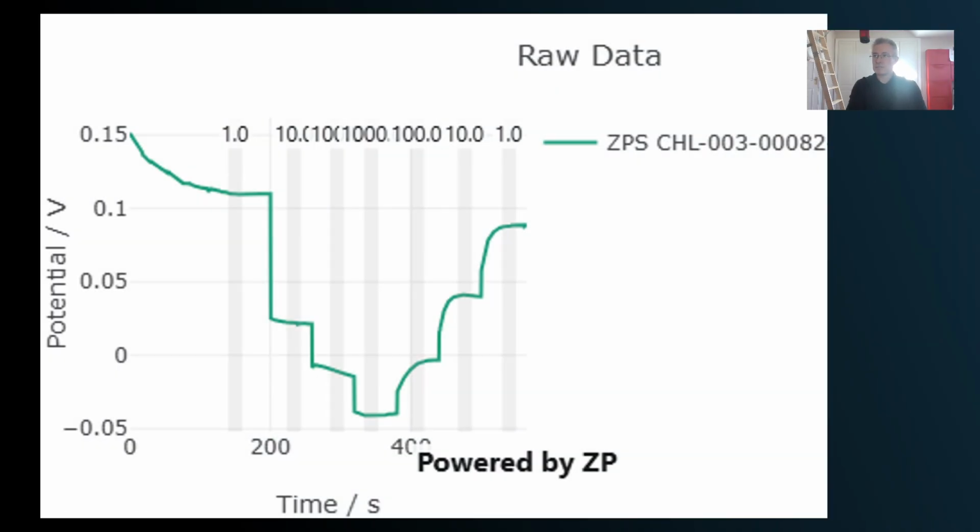Now, I just want to bring up the signal because when you're measuring the salinity of seawater, if you're doing long-term monitoring, you have to understand where the sensor and where the data is at. So what we have here is 1 millimolar chloride solution, and we have a certain raw signal measuring potential here, 10 millimolar, 100 millimolar. Now we're starting to get close to where seawater really is. I think it's about 135 millimolar. The reason I say think is because I seem to remember that blood and seawater actually have similar salinities. I mean, I know blood is 135 millimolar.